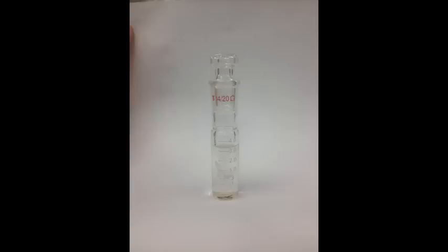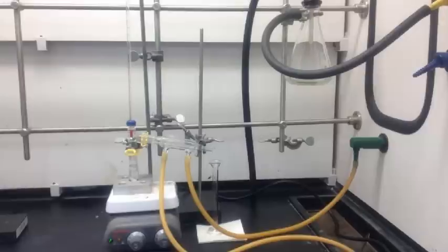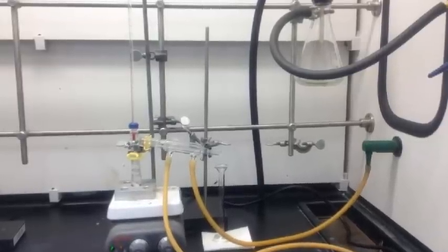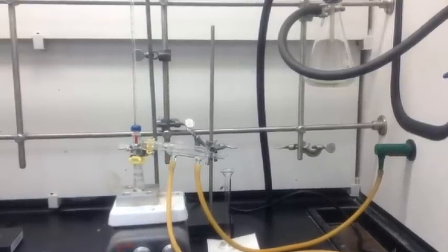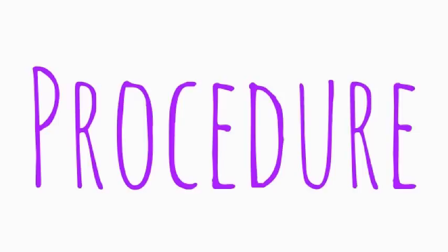Also, a 5 milliliter conical vial. These are all used to form simple distillation apparatus. I also use a 10 milliliter graduated cylinder as the receiver. On the condenser, the right side hose is connected to water, so water goes in, left side is where water goes out.